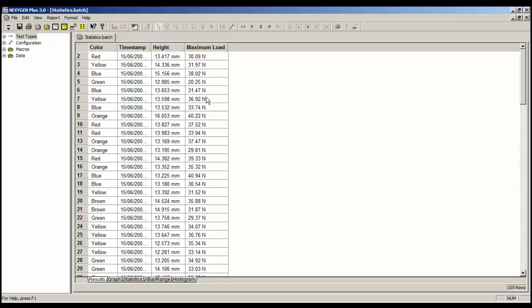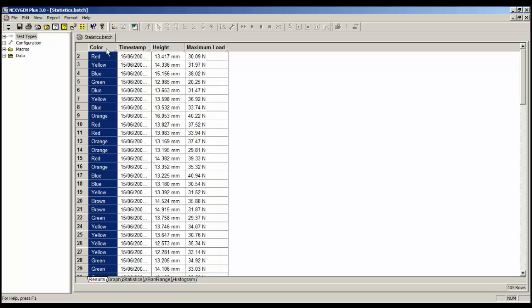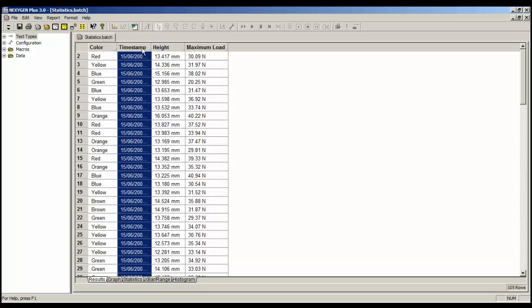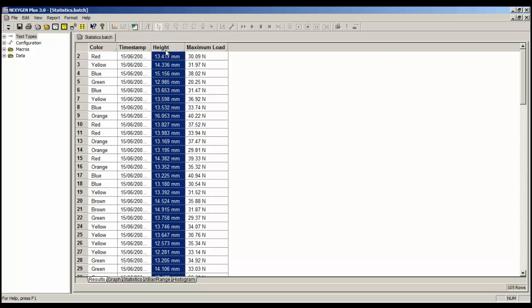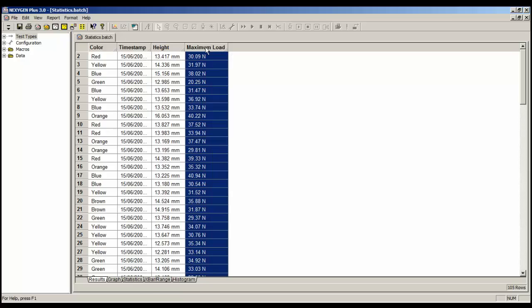All the rows are shown with a white background, because we have not defined any pass or fail conditions. The table shows that the main results are sample colour, the date and time, the sample height, and the maximum load measured during each test.